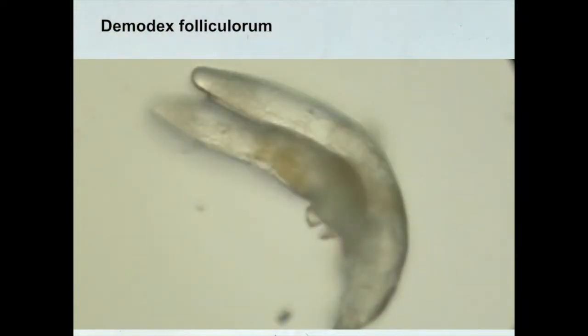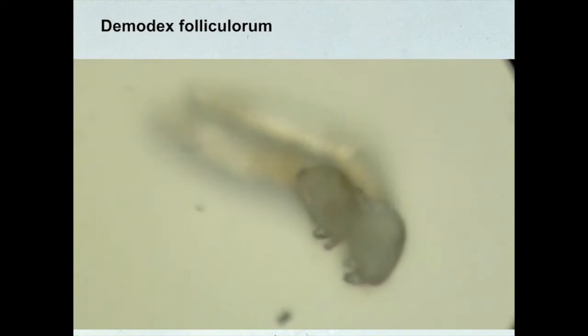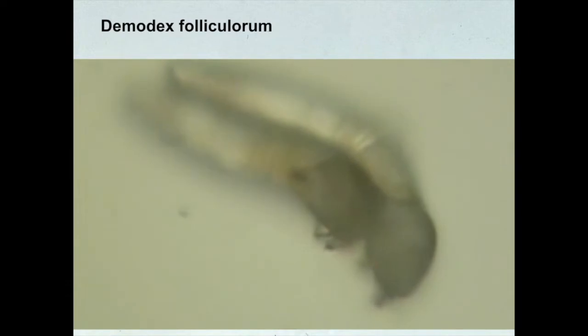Here's a short movie from Dr. Henry Perry showing the Demodex wiggling around in a preparation. Probably everybody has some degree of Demodex. They also occur in the ears. I think they were actually first found in earwax.